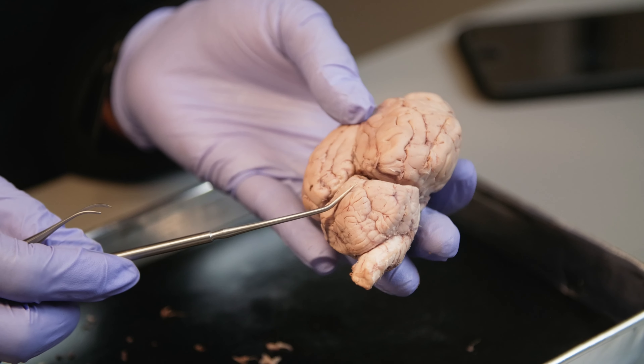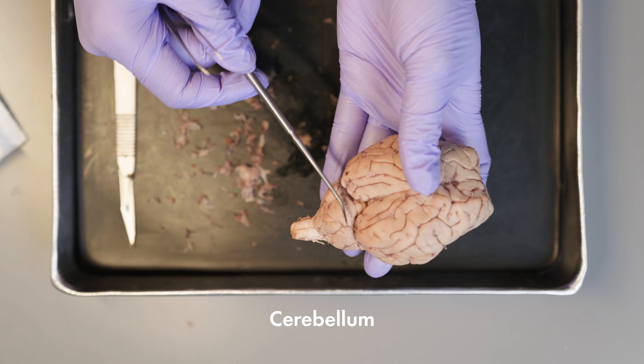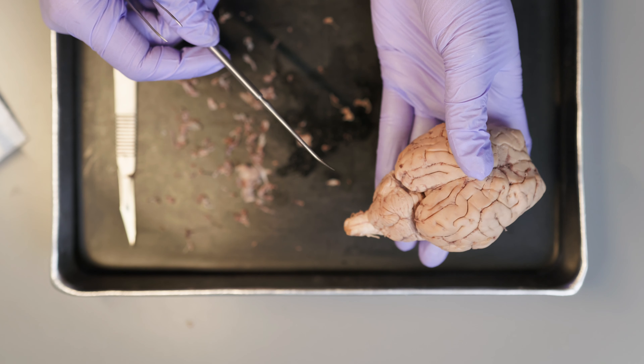Here we have the cerebellum, which is behind the occipital lobe of the cerebrum. The cerebellum controls balance and muscle coordination.